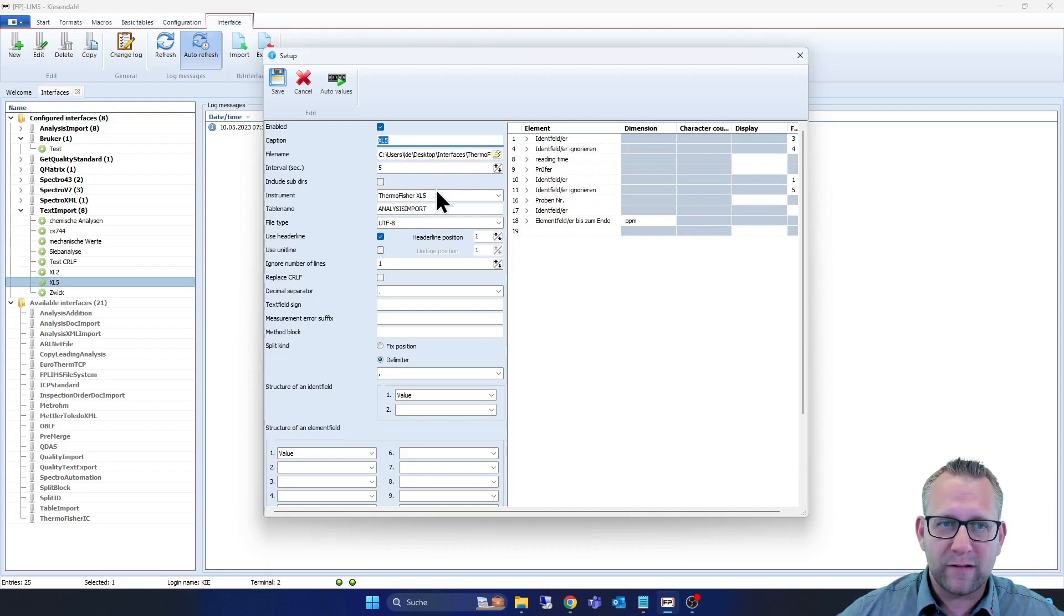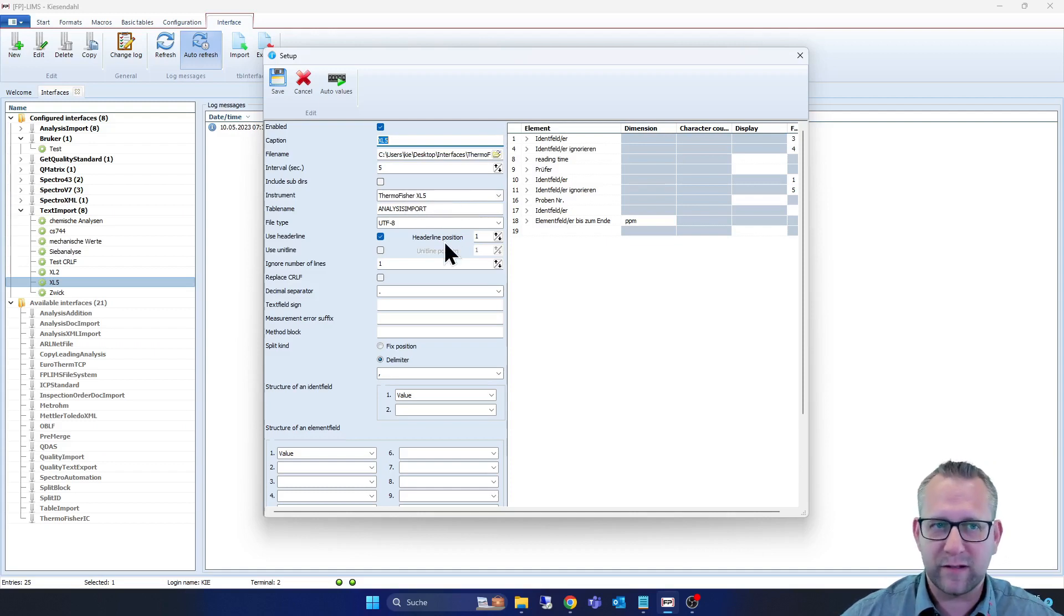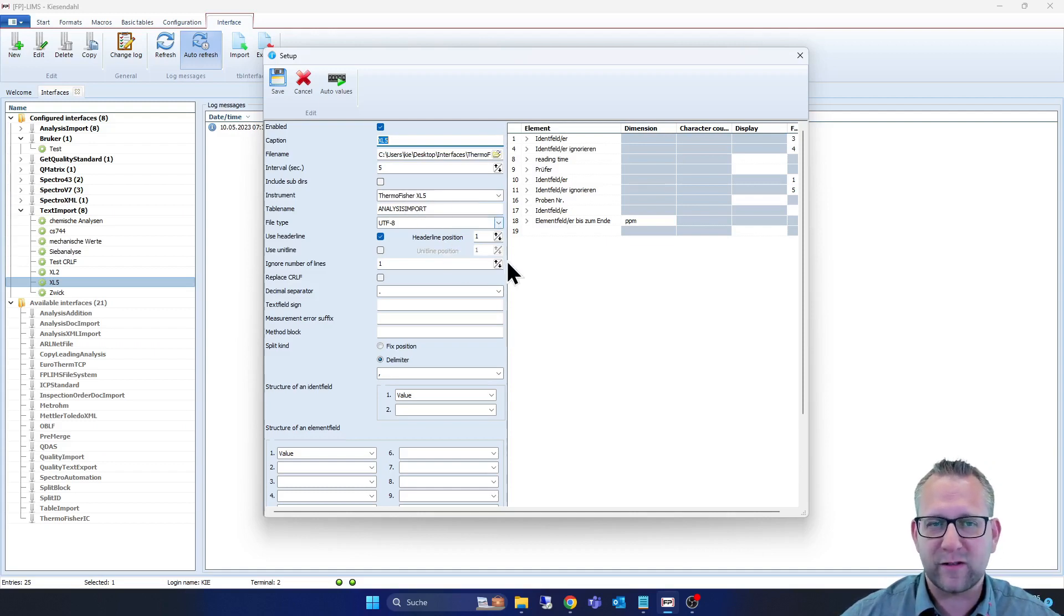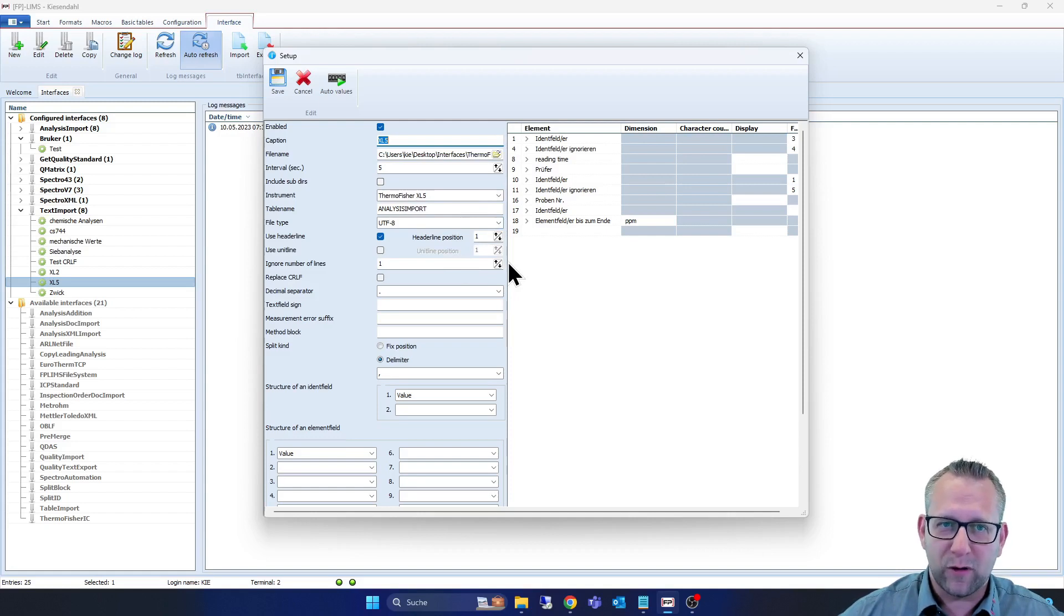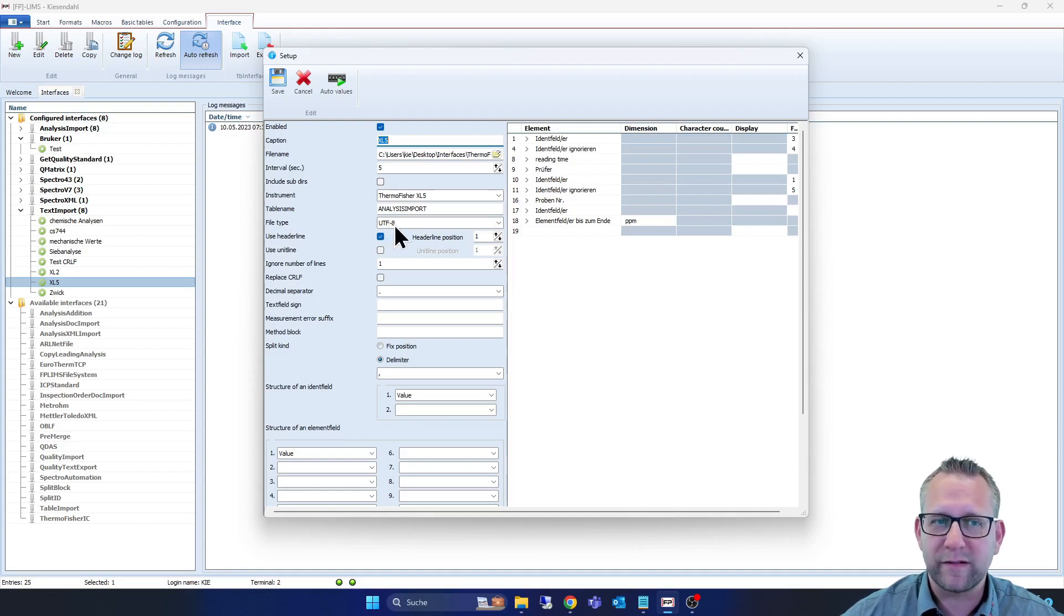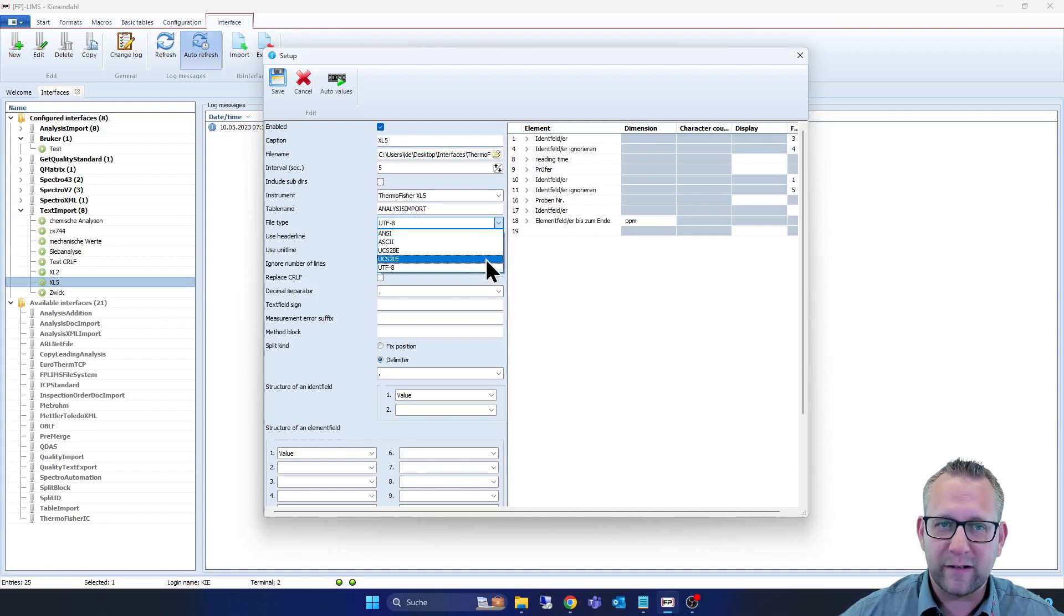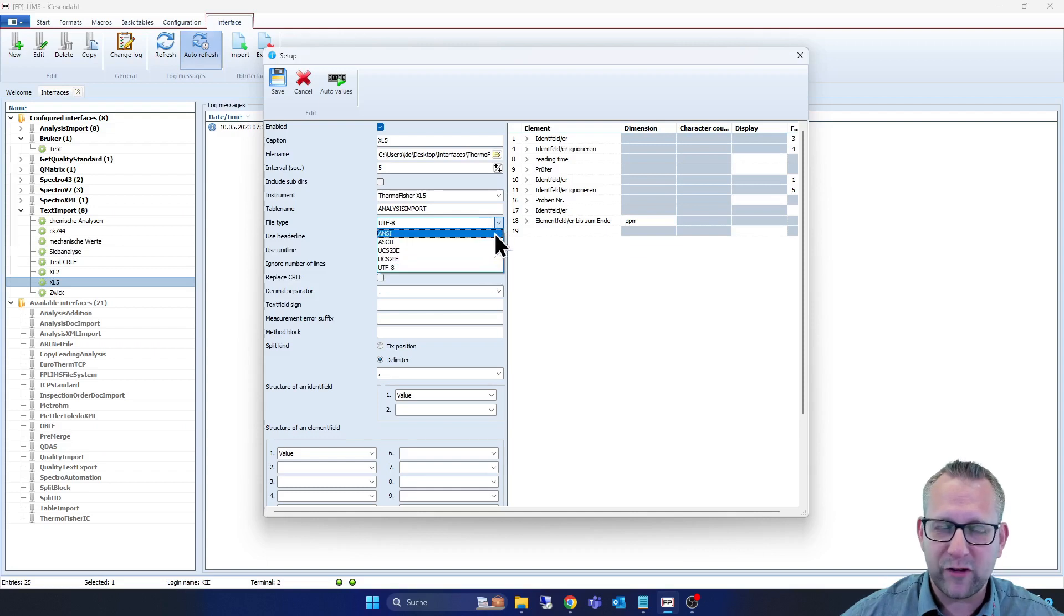Under this we also have an instrument manager into our FP-LIMS, and you can name the instrument. That makes it easier to get an overview about all your different devices. The table name, and here now we find the file type. It's UTF-8. We can select it here, different file types from different measurement devices, and this one is the UTF.